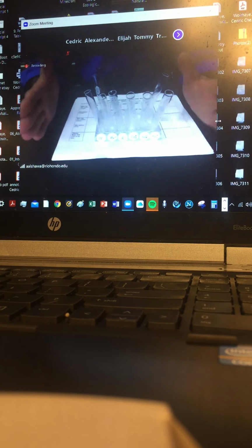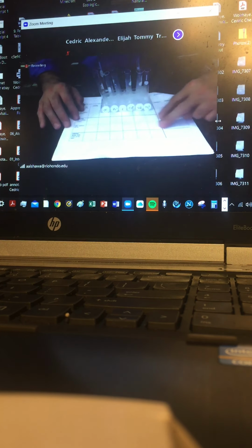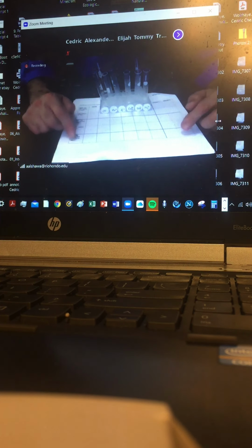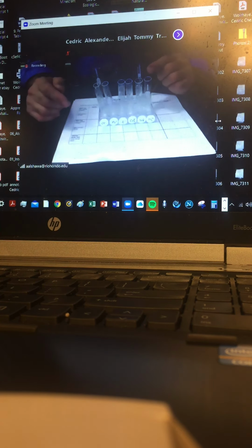Well, there's something going on that has to do with the phosphate. Okay, so that's the second part, and it's all complete. So we checked the barium chloride for the existence of the sulfate, and that part is done.